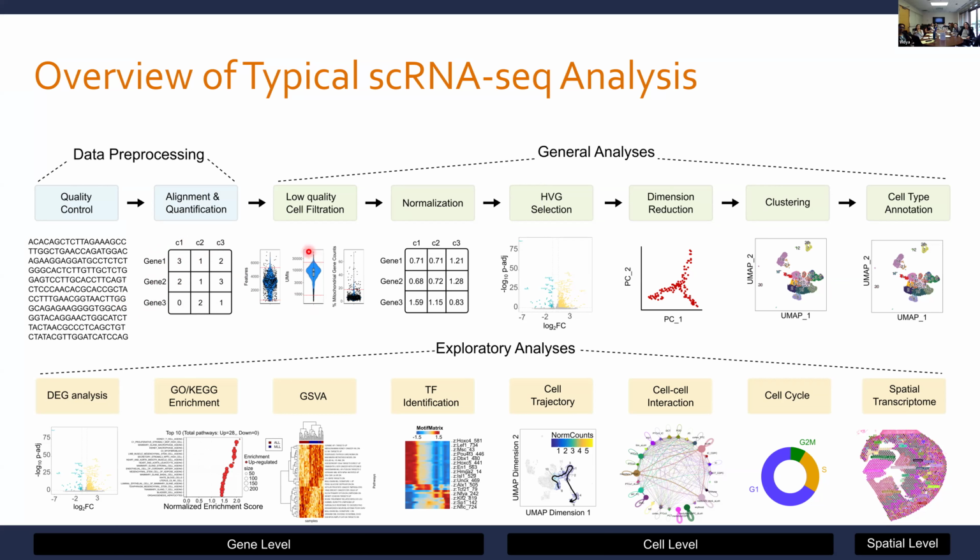And so the first step, as is universal to all of these approaches, is some type of QC. And that's challenging because there's no hard and fast rule for what is good or bad. It's always qualitative to some degree, where you have to make decisions. A typical filter would be removing cells with a really high mitochondrial DNA content because you think that's basically junk.